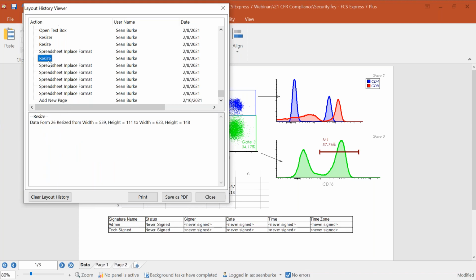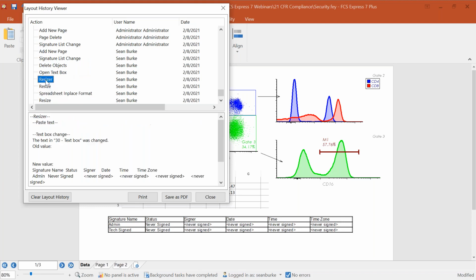And what you're going to see is that, when we log these audit trails, we capture every sort of information that can be done with this, right? So if we resized a text box or the width of something like that, it's going to record what the width was before, what the width and height was after, and we're going to be able to have all of that audit trail history for us wherever we want to start from.